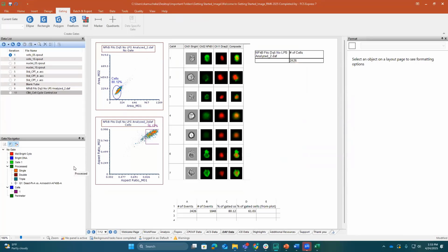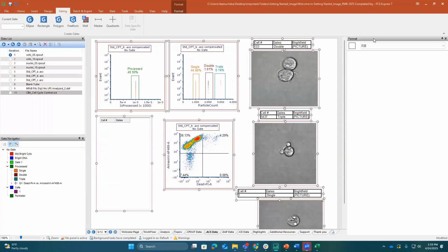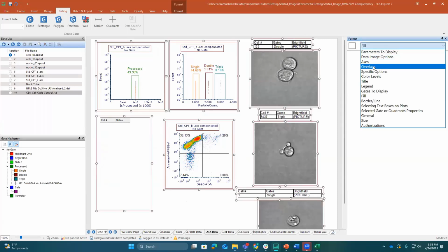Going back to our iterations. Iterations come up a lot because when you're running batch export, if these are grayed out, it won't run through all of the data files. So some other tricks, if I'm using other data in other spots, what I can do is I can tell certain plots not to change the data files. So then it can conserve all of my plots where I'm using the data.